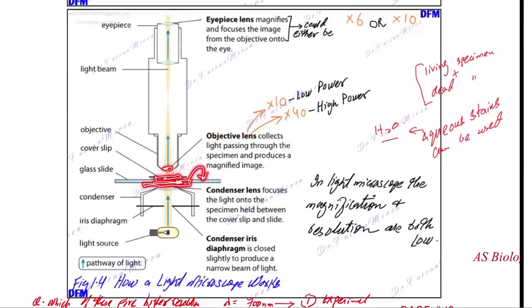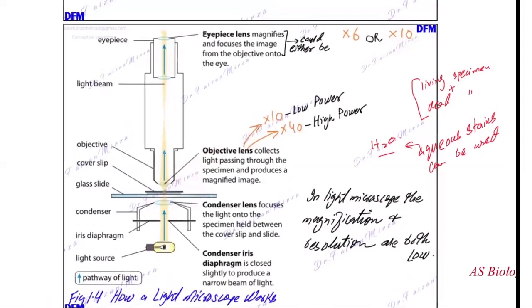So once you handle the light microscope, you basically understand what these references, these structures are. And just beneath this stage, you have another lens, the condenser lens, that collects all the light which is being emitted from the bottom of the light microscope. So when you have the light microscope arranged in this way and you turn the light on, the light passes through the condenser lens, it gets focused, and it passes through the specimen, it crosses the objective lens, it travels up in a straight path.